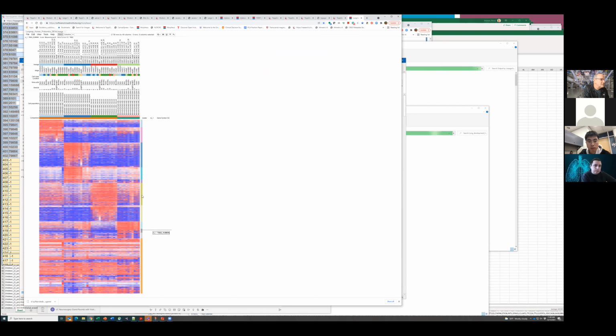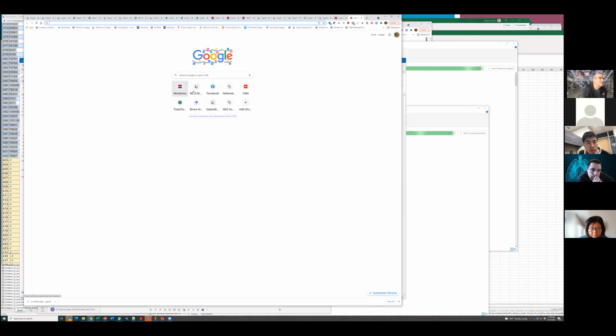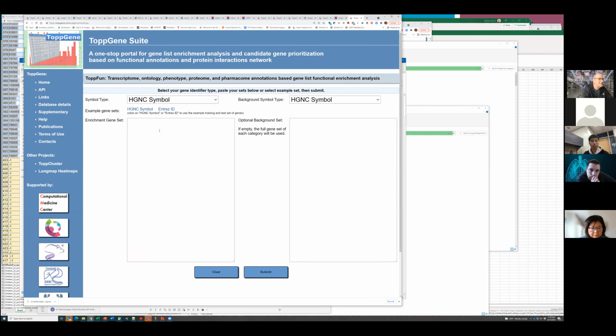Here is this dissection of the proteomics data. Here's all the immune cell signature. Here's the mesenchymal cell signature. So let's take the mesenchymal cell signature, and then you can see what the overlap is with the other authoritative signatures that we get from the single cell data sets.